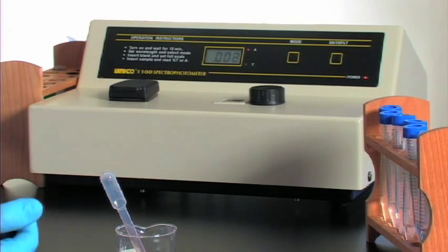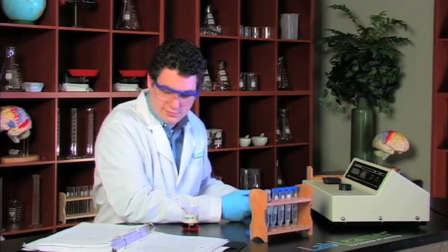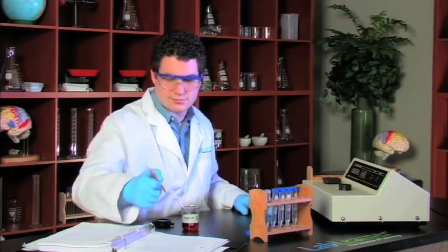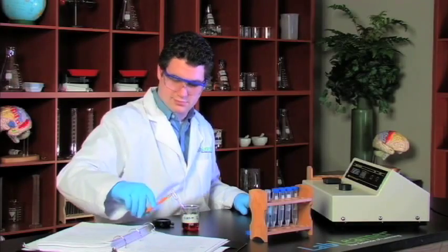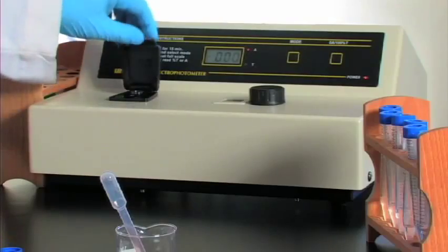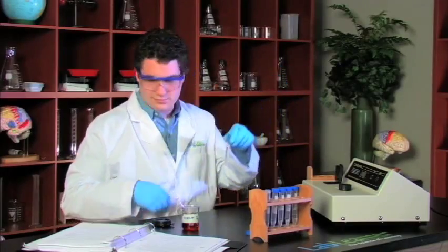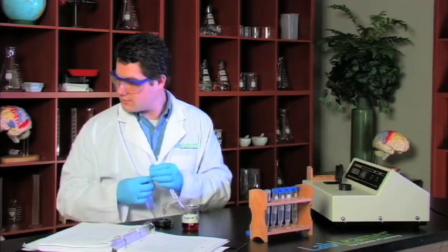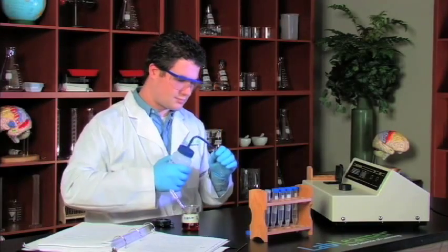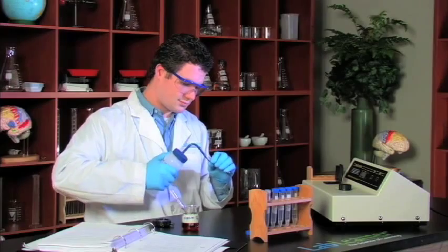So in the first two investigations we follow the chemical reaction by looking at the formation of a product, and in this third investigation we follow the chemical reaction by looking at the disappearance of one of the reactants. Combined with data analysis and classroom discussion, students should be getting a very good hands-on feel for chemical reactions.